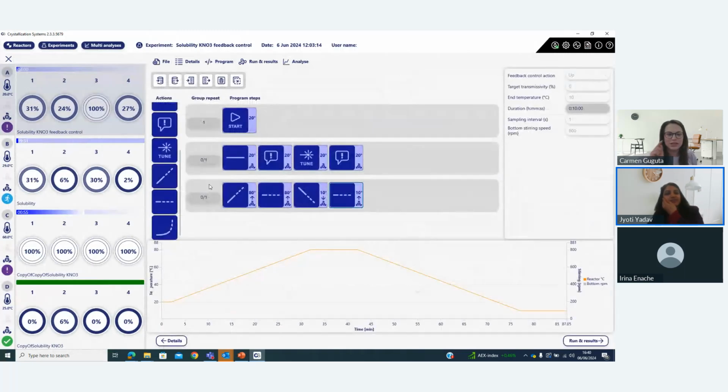It might be that you do not have the latest version of the software. You should check if you have the latest version, and also check if you have by mistake set a repeat. If you still have this problem, you can write to our service team and we will get back to you.